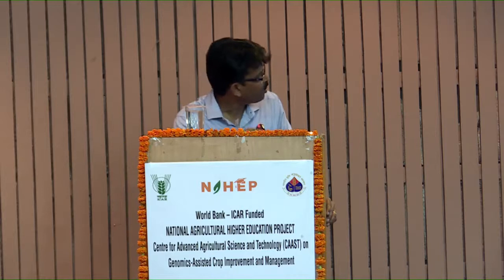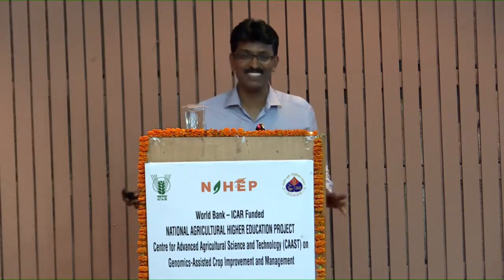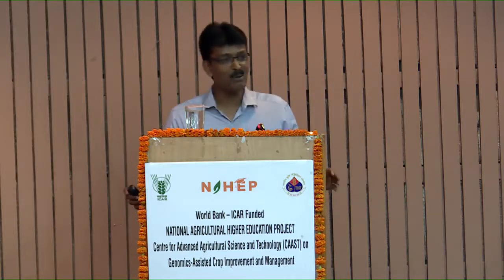So the non-specific detector is nothing but a fluorescent dye, nothing more than that. You have a PCR mixture, you add the fluorescent dye. What is the most frequently used fluorescent dye? No, let's not go there. In conventional PCR, ethidium bromide. It's a fluorescent dye, correct? So you can use ethidium bromide also here.